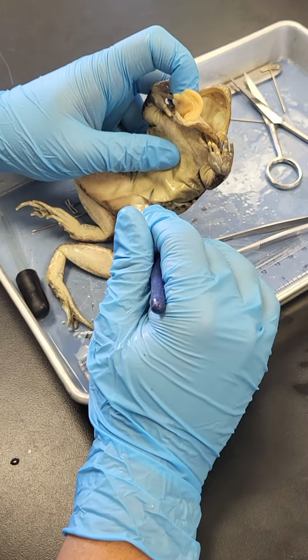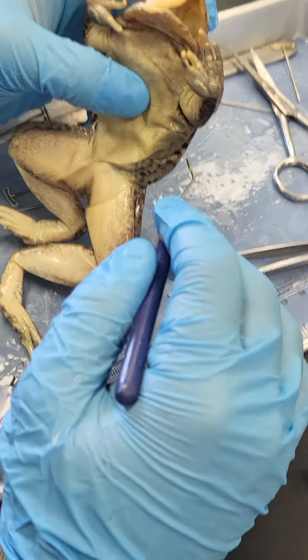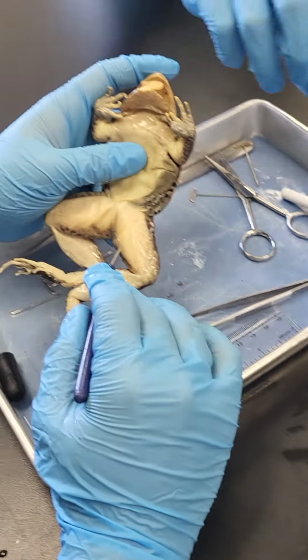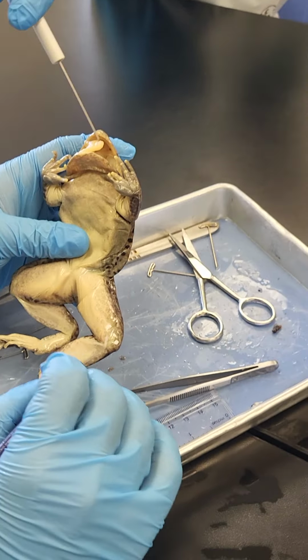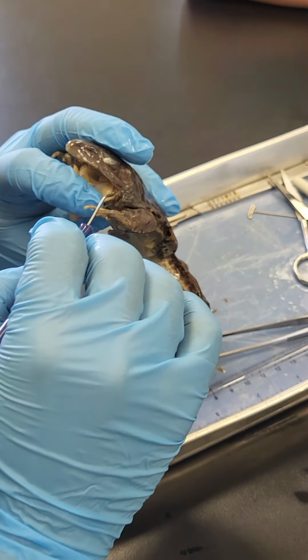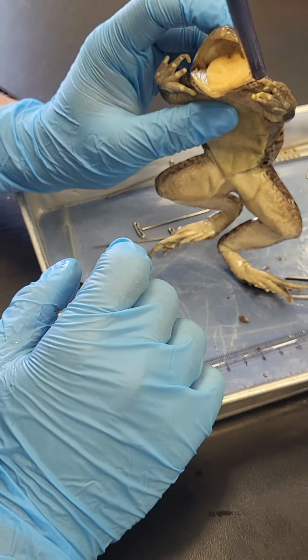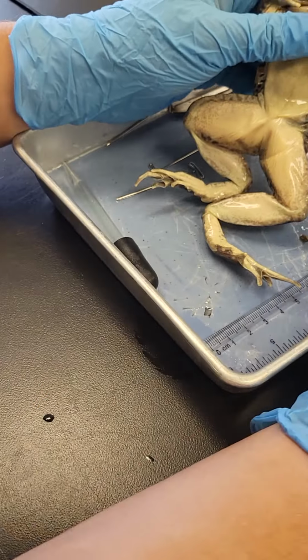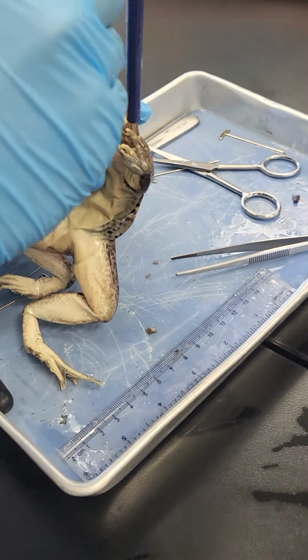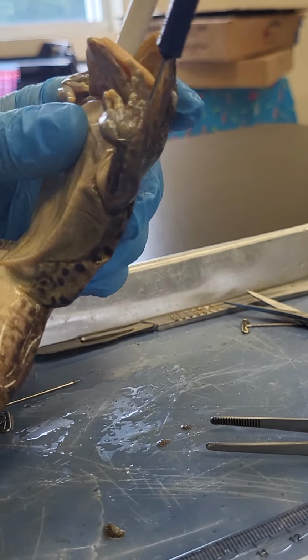Guys, probe until the Eustachian tube. Where is that? Close to the angles of the jaw are two openings on each side. Closest to the jaw. That's not how it works, man. You probe the top of the jaw. Yep, I probed it. Okay, I can probe the other side too. Dual probed. Oh no!